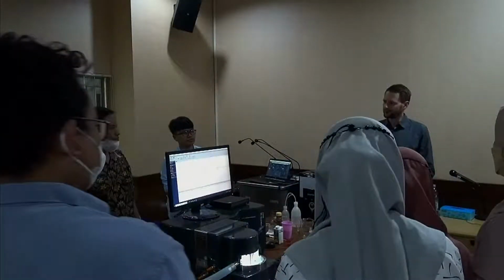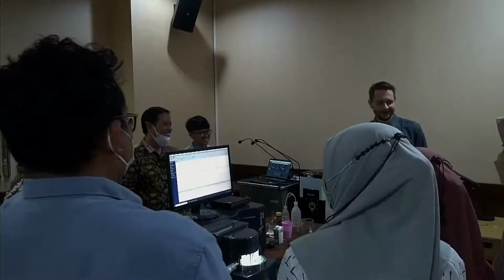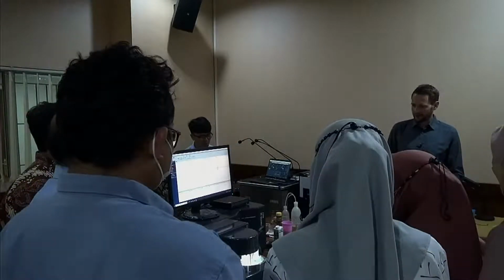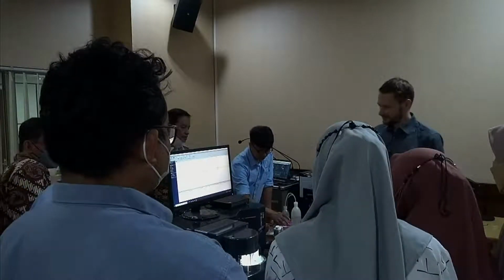So now I'm not in such a rush. We can relax, go slow, take half an hour if I have to. That's good. So, same thing as with the other groups. We start with the hardware, show you basically the delivery state of the instrument.